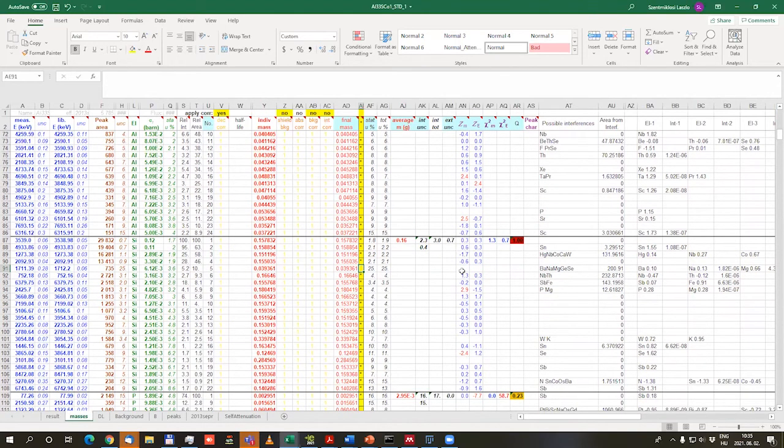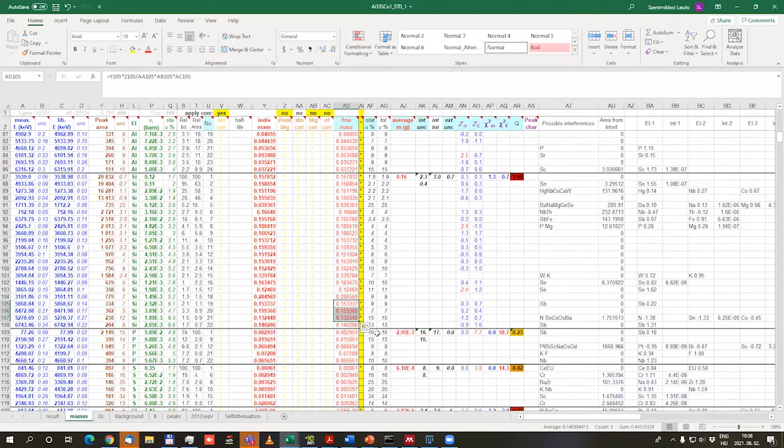And wherever you see this blue highlight, those lines are fitting nicely to the tendency, so they give agreeing masses like this. And wherever you see some higher mass, it's probably an improperly corrected interference. So those ones you can unselect if you want.